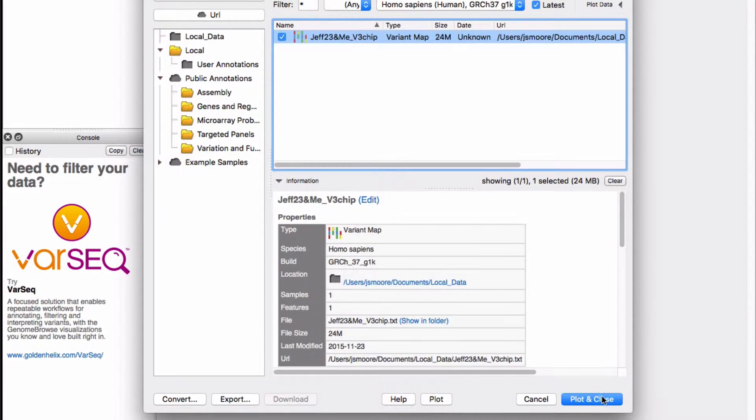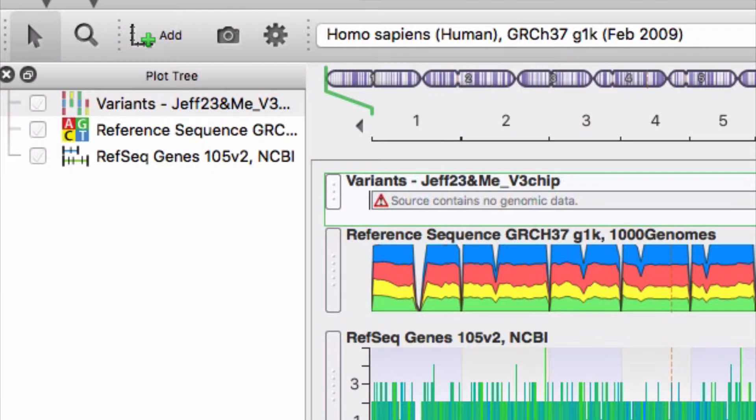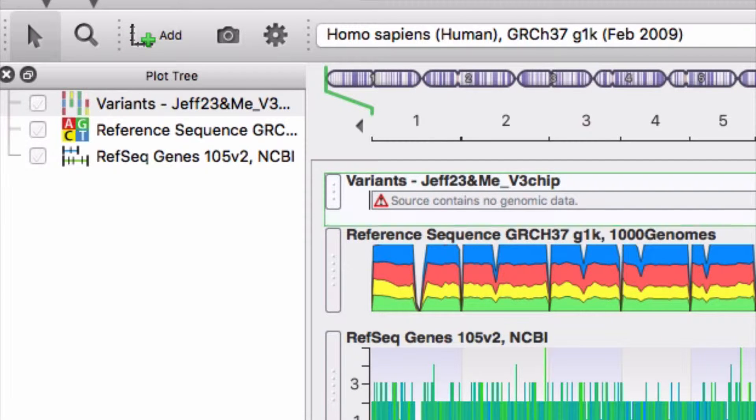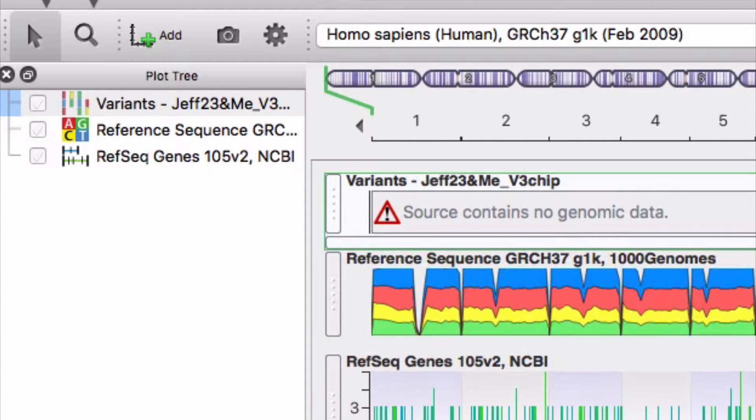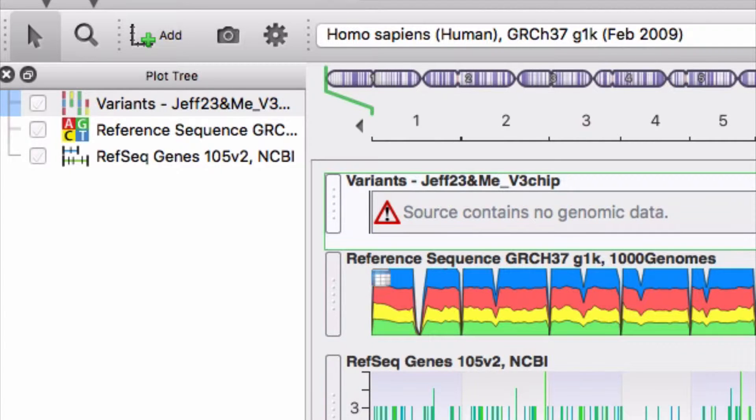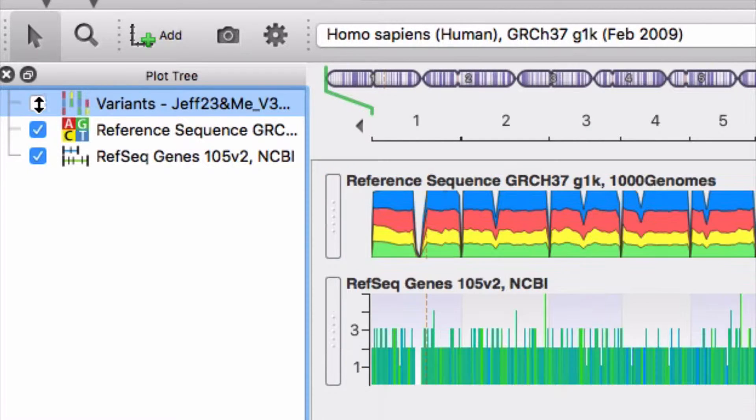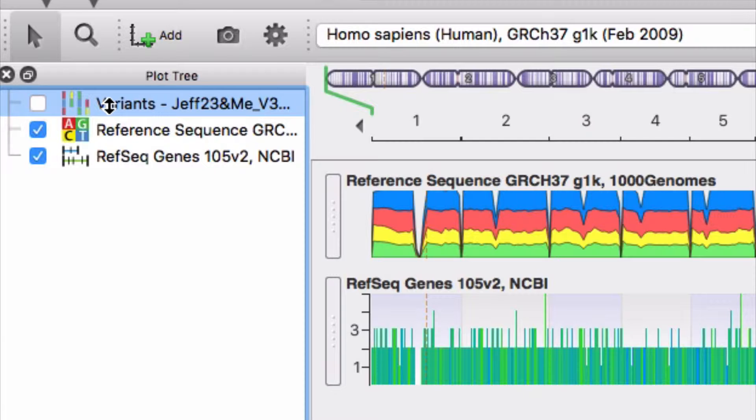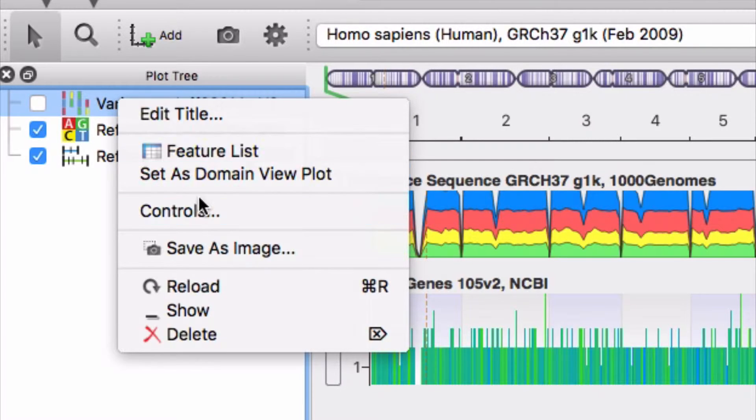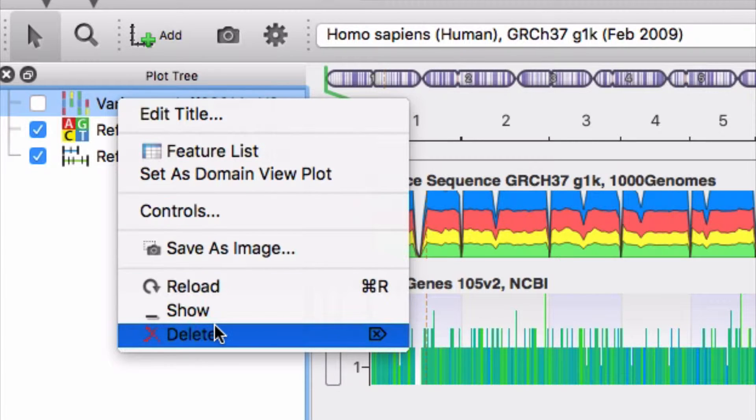Check the box next to the file, then try to plot the data with plot and close. The raw data cannot be plotted in Genome Browse. The raw data must first be converted into a format that Genome Browse understands. Delete the track containing the unsuccessful attempt.